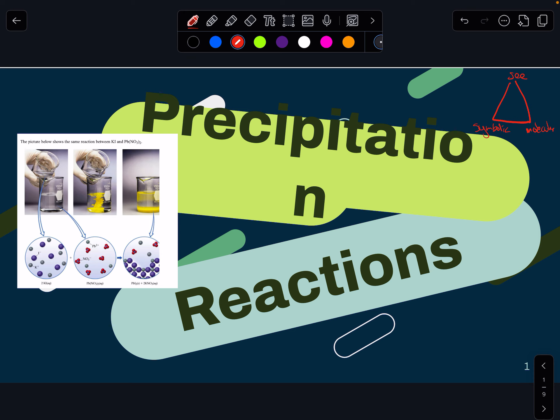Reminder of precipitation reactions, this is the one we did in class last time where I mixed the two aqueous solutions of KI and lead nitrate Pb(NO3)2. Before they're mixed, the ions are just floating around together, but then once they mix together we saw this yellow precipitant get made, that was our solid down here, and then we talked about how the ions that are still just floating around, those are our spectators.